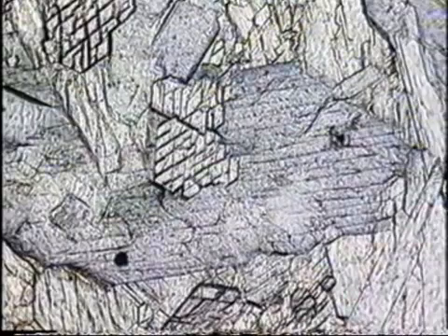Sodic amphiboles have a bluish colour. This is crossite, intermediate between glaucophane and riebeckite. Glaucophane is paler blue and riebeckite is very dark greenish blue.